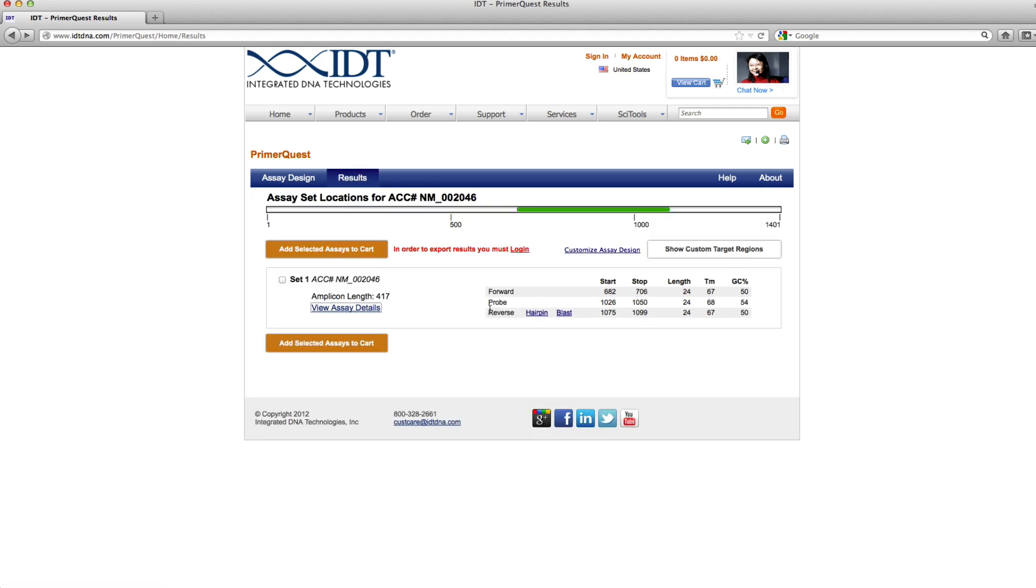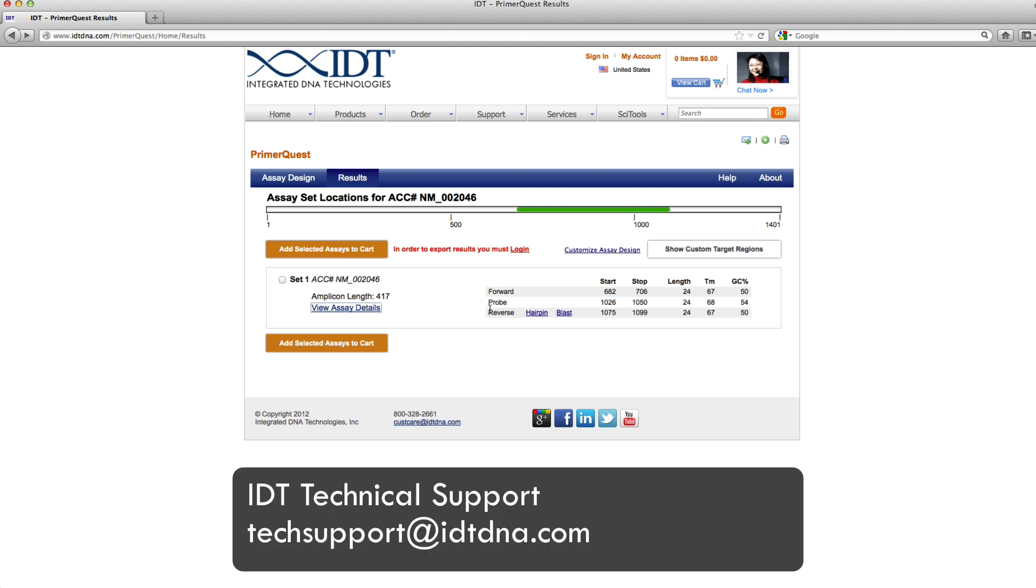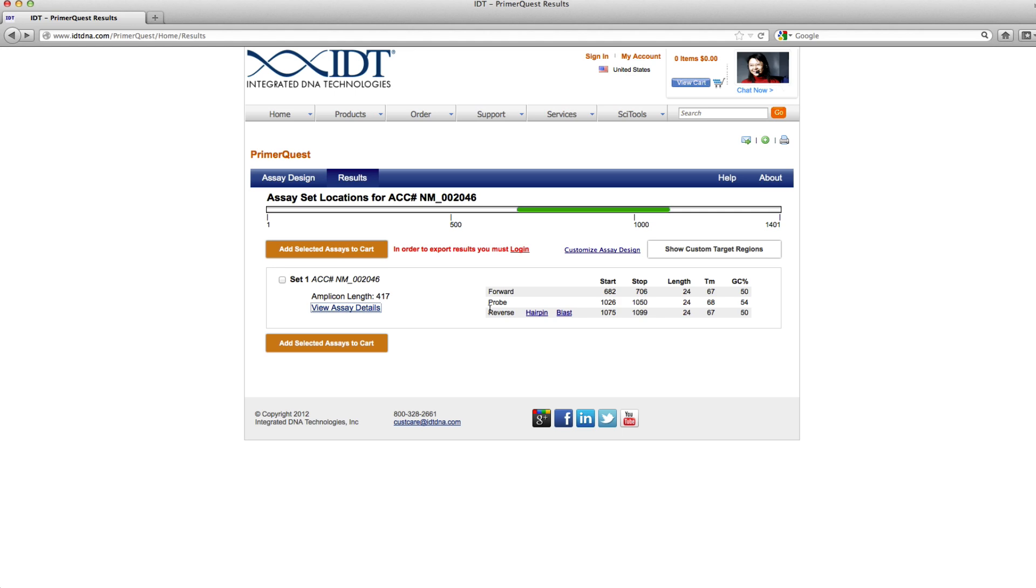I could just go ahead and order just the probe from this area or I could order the entire assay. That was a quick review of how to design a probe sequence when you have a forward and reverse primer sequence already designed. If you have any other questions, you can go ahead and contact tech support here at IDT. Thanks!